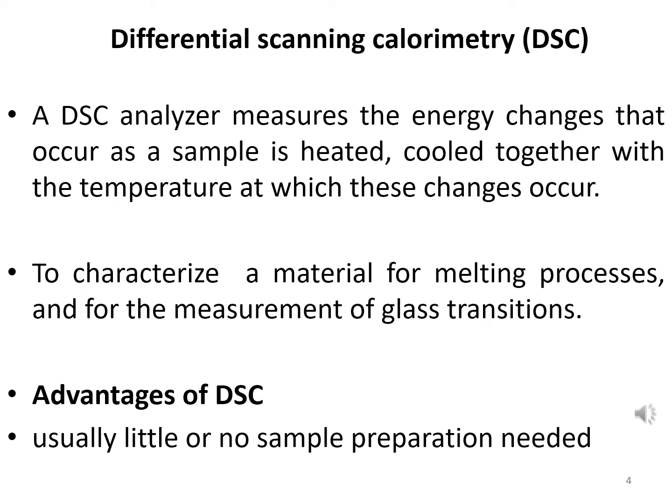One big advantage of DSC is that samples are very easily encapsulated, and very little or no preparation is required for DSC samples.